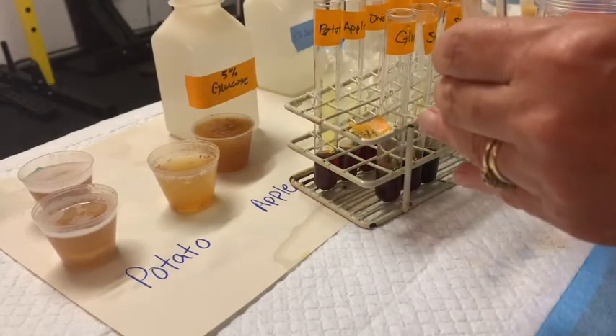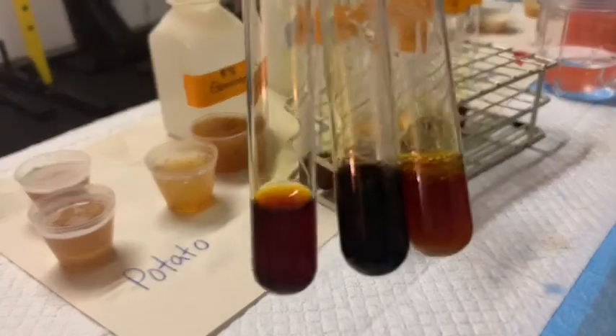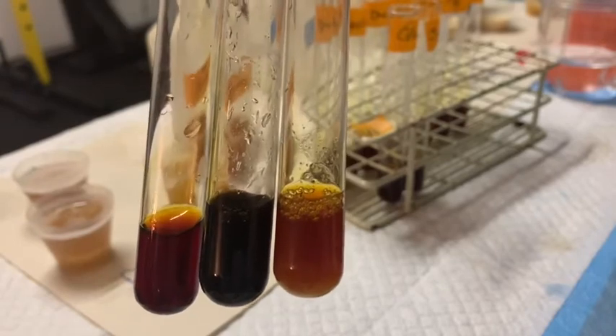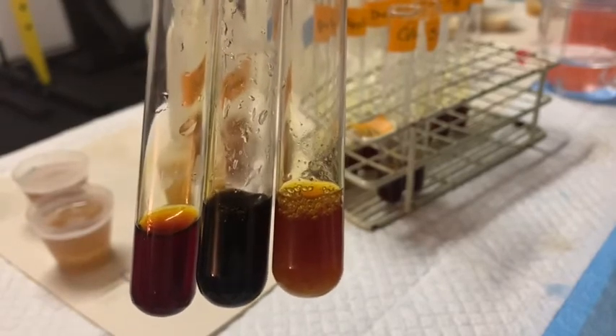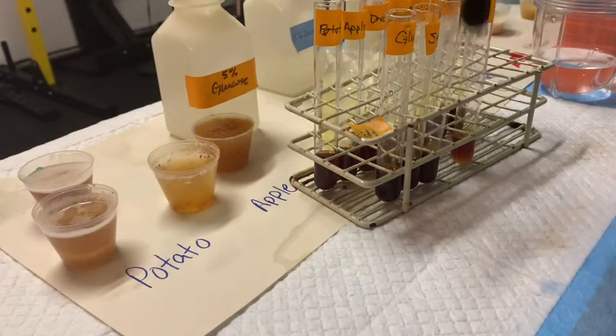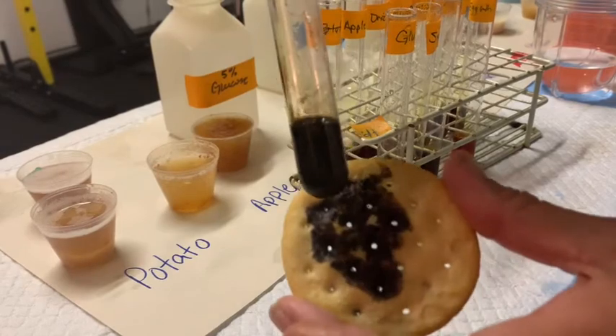Let's compare this now to starch and to egg whites, and look at the difference. Can you see the difference there? The starch has a nice brown black color and our egg whites again look a lot like the negative control. Let's keep our starch out — notice that it's nice and black just like the cracker.